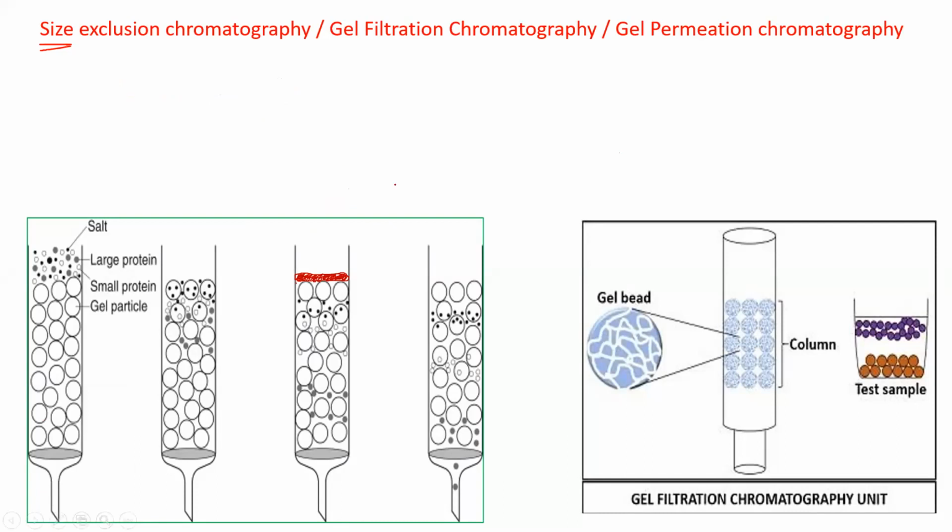Now if you have beads of different pore sizes and you add your extract, you're going to load your extract on this layer. Now what is going to happen?